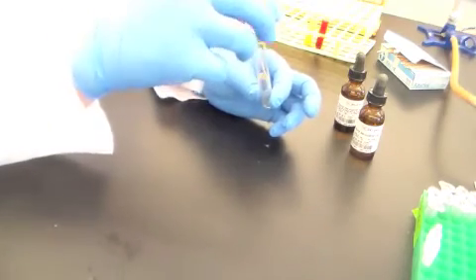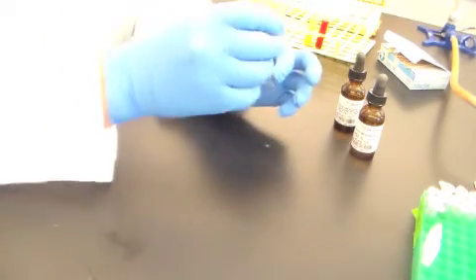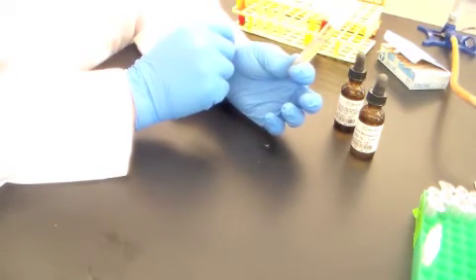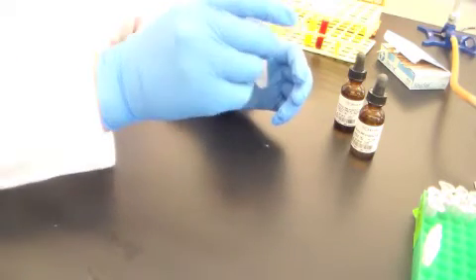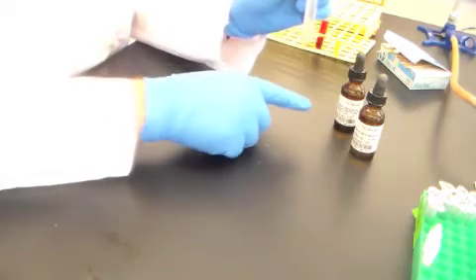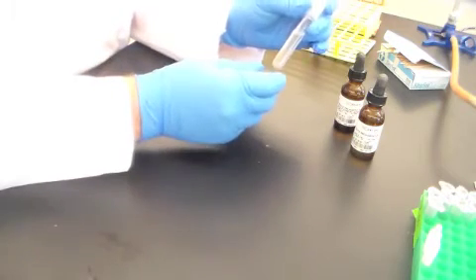So when we add this toothpick to that mixture, if there are any nitrate molecules left in there, the zinc will reduce them from nitrate to nitrite. And since we've already added the reagents, nitrate A and nitrate B, the reduction by zinc of nitrate to nitrite should give us a red color.